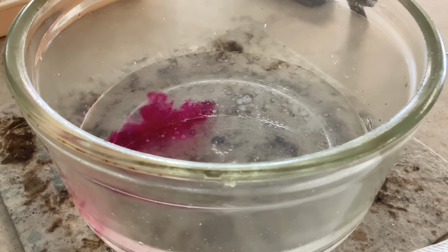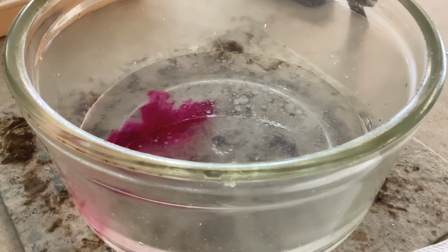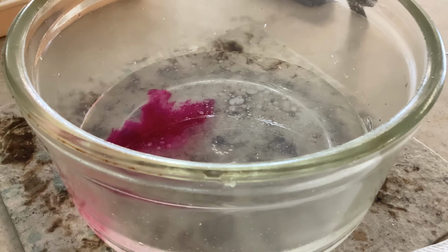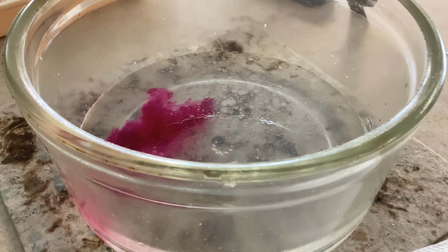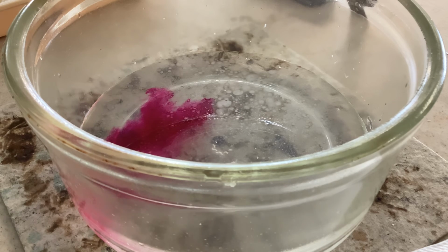And to answer the question I asked previously, do the sodium or potassium disappear? The answer is, as metals, they disappear. However, after this chemical reaction, they turn into a soluble alkaline substance and dissolve in the water.